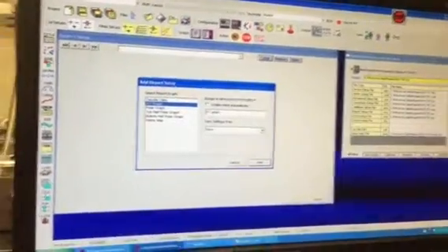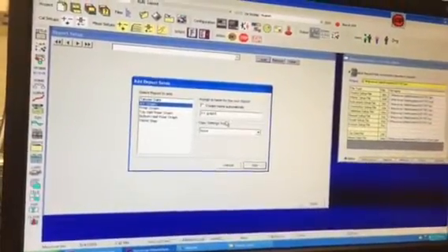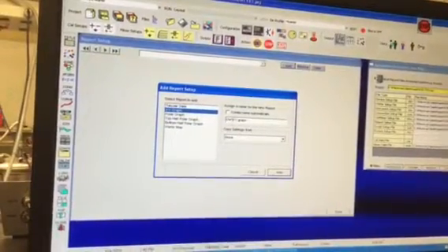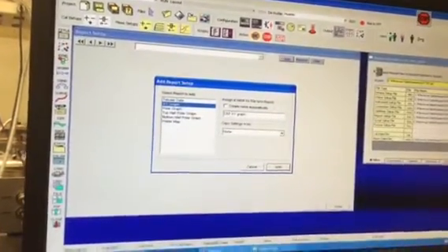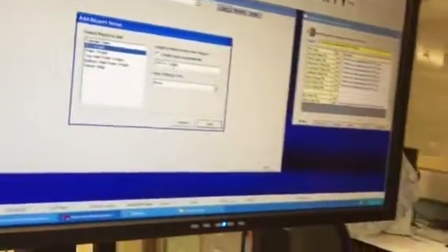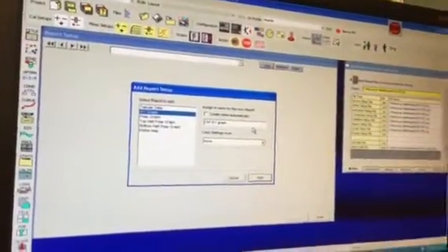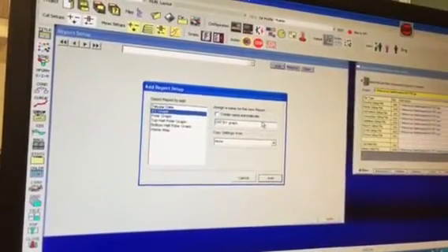Those are really just different little tools for arranging windows, like the ones that say Cascade or logo. You can put the Notre Dame logo into your plots. You can get rid of the logo and put your own logo. Those are a lot of just little extra added things. They're all available through the upper menus too.